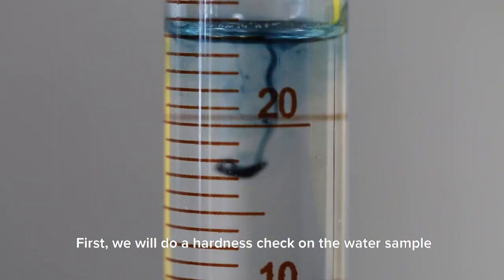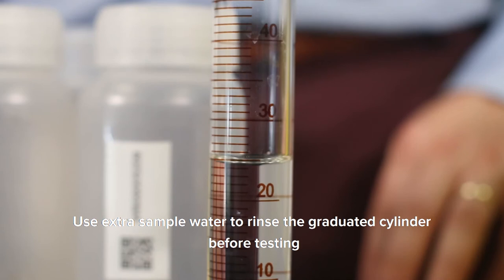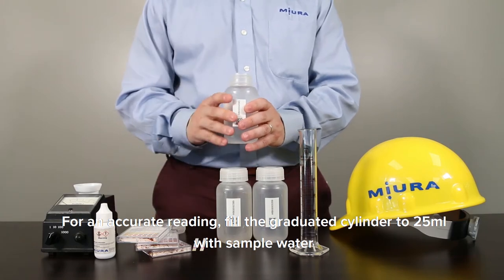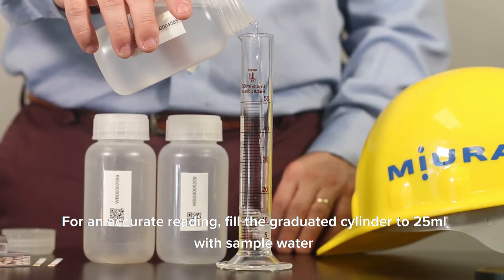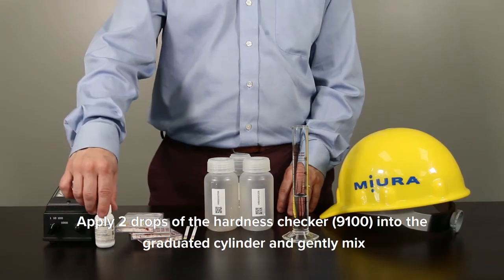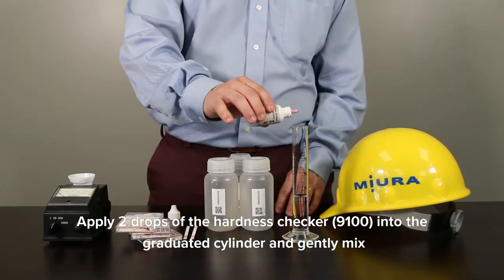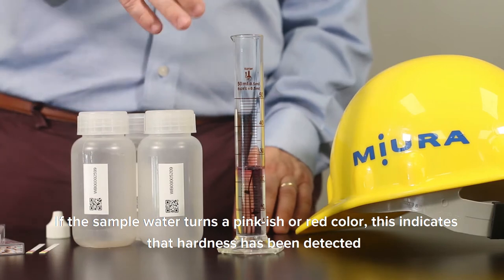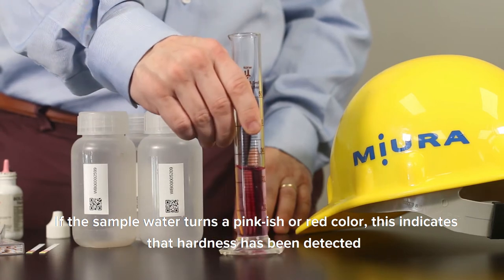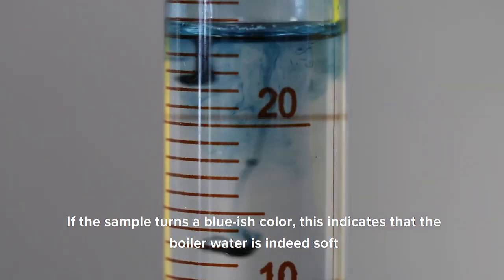First, we will do a hardness check on the water sample. Use extra sample water to rinse the graduated cylinder before testing. For an accurate reading, fill the graduated cylinder to 25 milliliters with sample water. Apply two drops of the hardness checker 9100 into the graduated cylinder and gently mix. If the sample water turns a pinkish or red color, this indicates that hardness has been detected. If the sample turns a bluish color, this indicates that the boiler water is indeed soft.